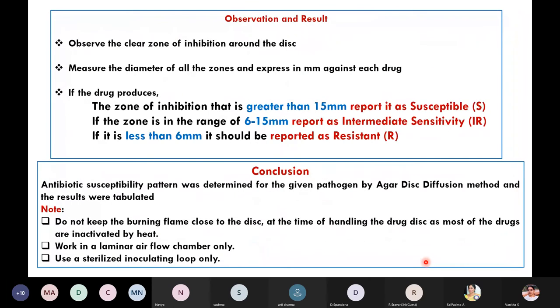Now for observation and results: after 24 hours, observe and check out the results. Observe the clear zone of inhibition around each disc and measure the diameter of all zones, expressed in millimeters, against each antibiotic. This tells you how effective each antimicrobial agent was against your organism.